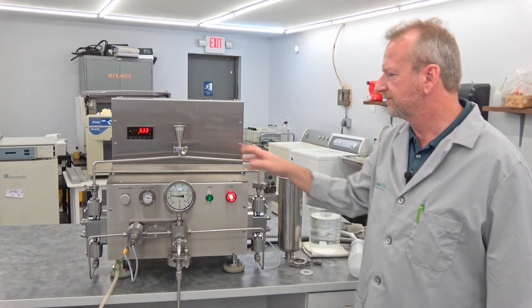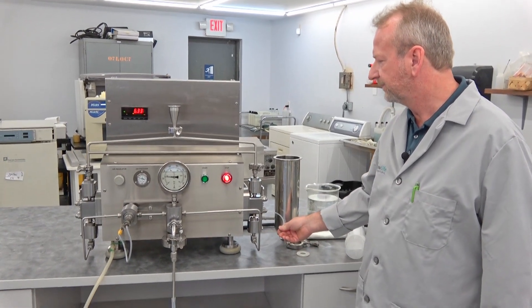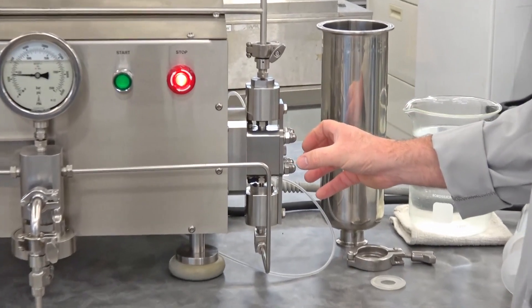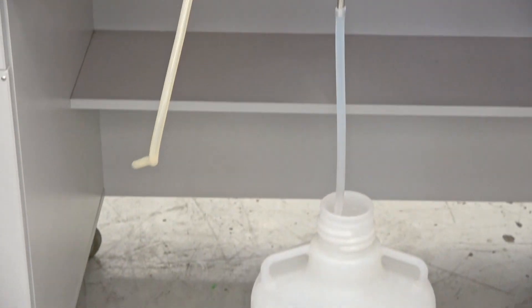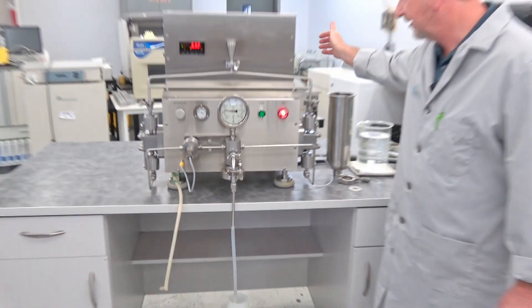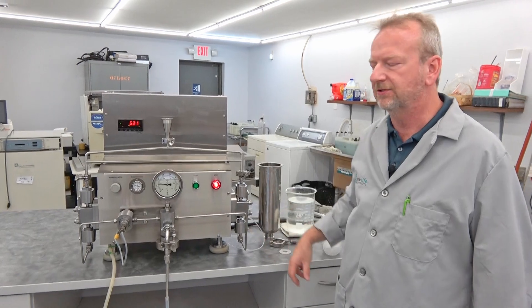This machine also has another option called a flush system that is able to flush the system out. That's what this hose does here — you can flush fluids through it, it hooks in the back, and it cleans out both pumping heads on both sides.